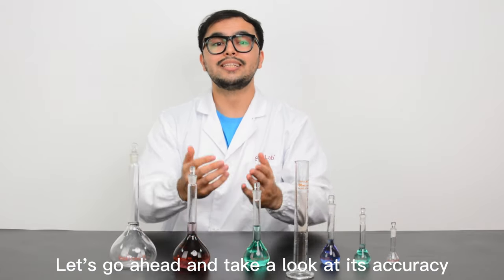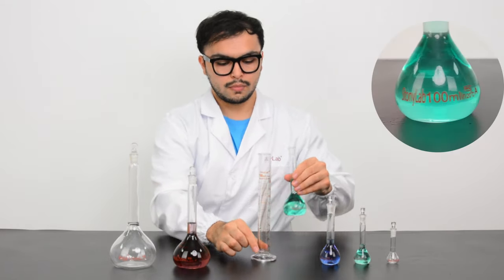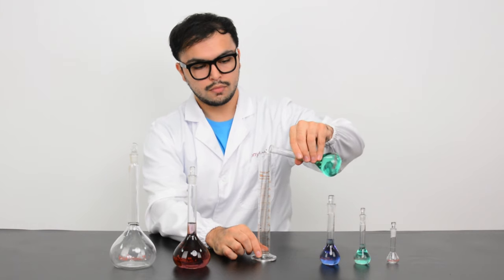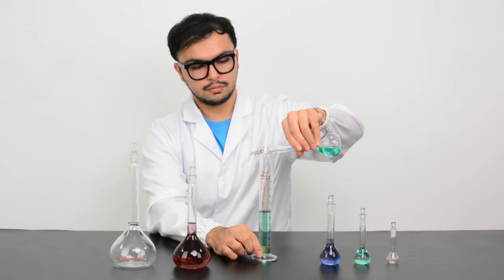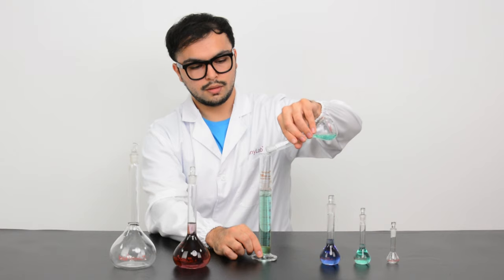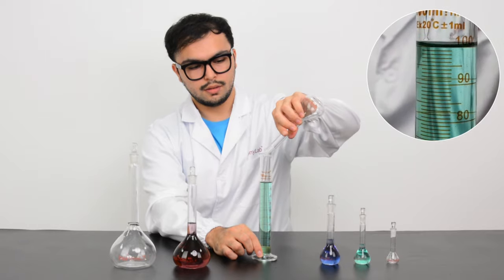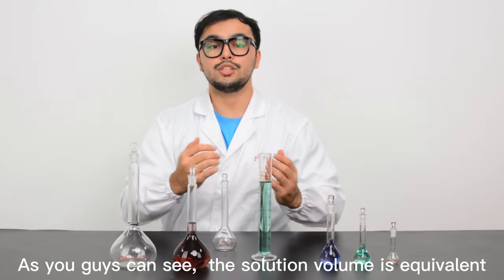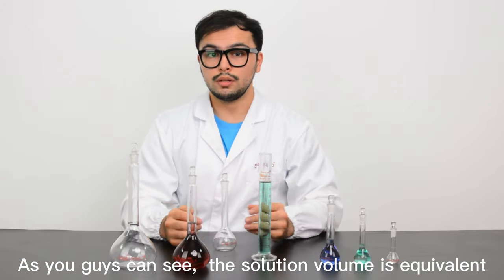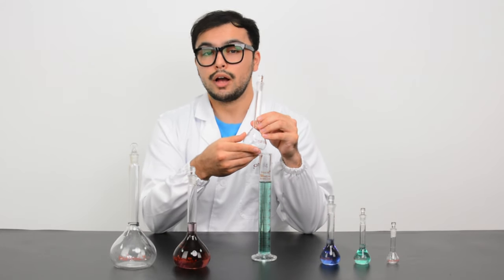Let's go ahead and take a look at its accuracy. As you guys can see, the solution volume is equal and StonyLab volumetric flask helps you to prepare a certain amount of solution accurately. Thank you.